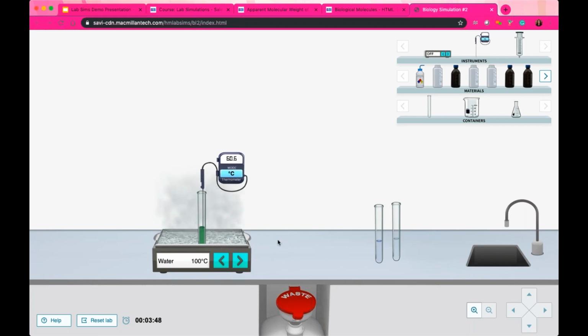And you can also see that we've thought about the water bath, you know, as it gets hotter, it should do different things. So you can see as this gets warmer, it does change colors, and those are very bright, vivid colors. Should go to red here shortly.